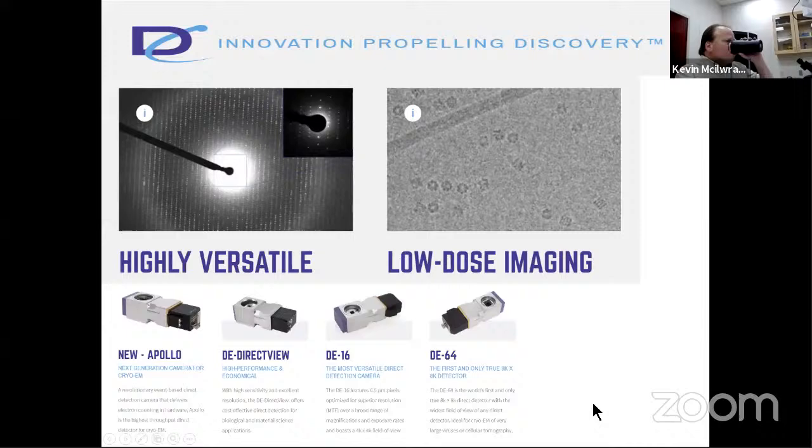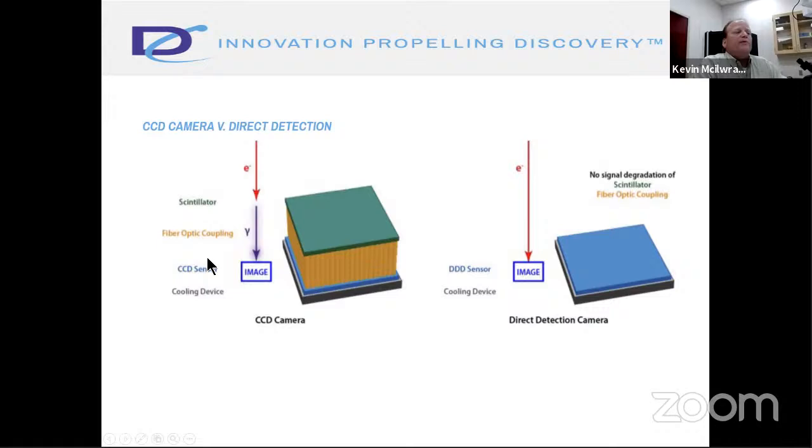Now, another company is Direct Electron. They make a lot of very high-end cameras. If you look at a normal CCD camera, you have a scintillator, fiber optic coupling, CCD sensor, then it's cooled. The Direct Electron sensor basically doesn't have all that fiber optic coupling. So it's capable of single electron counting mode is what they call it.